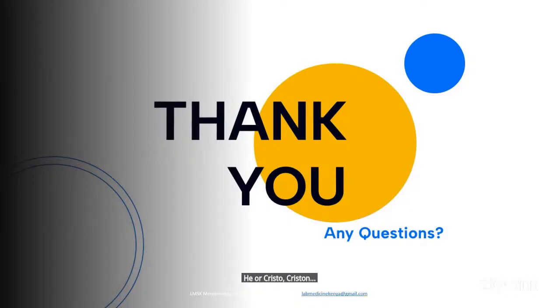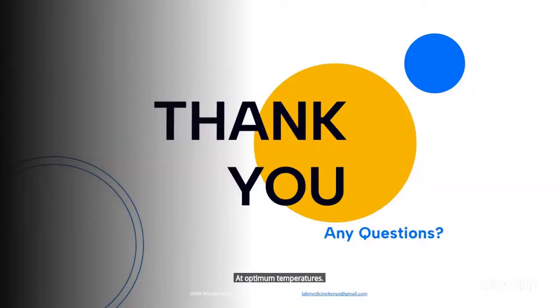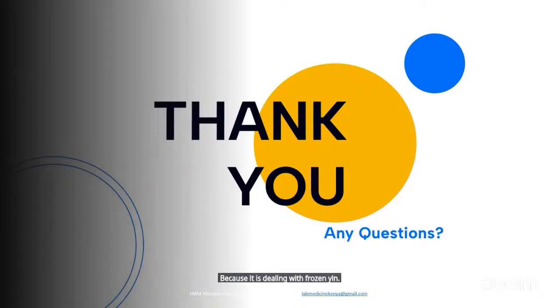the machine, the cryostat, the one which is used for frozen sections. When you were presenting, you said that it is supposed to stay at optimum temperatures. I wanted to understand the optimum temperature of that cryostat. Is it the normal body temperature, that is 37 degrees, or because it is dealing with frozen sections, a different temperature?